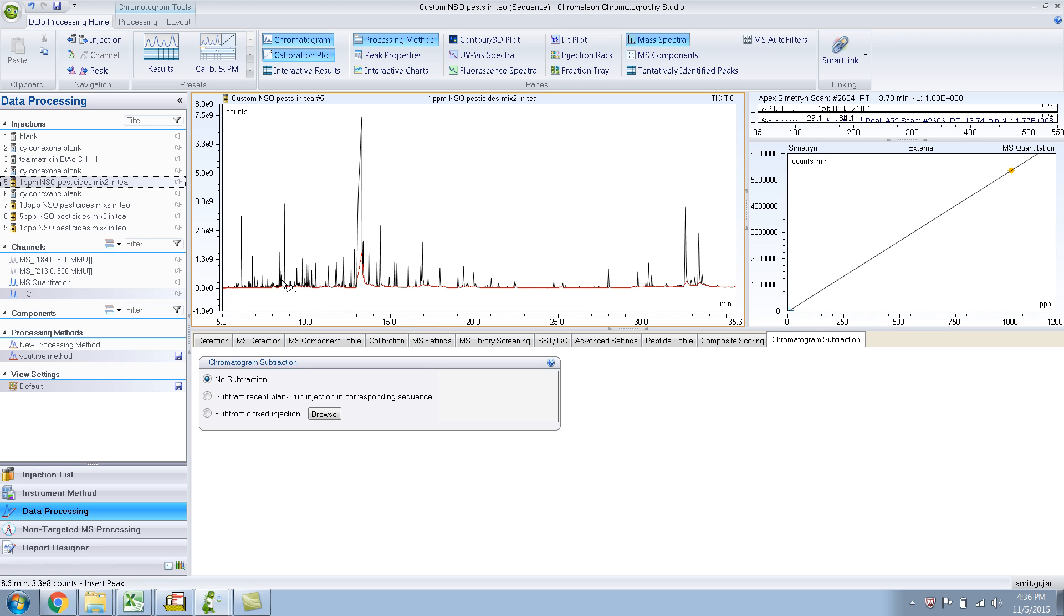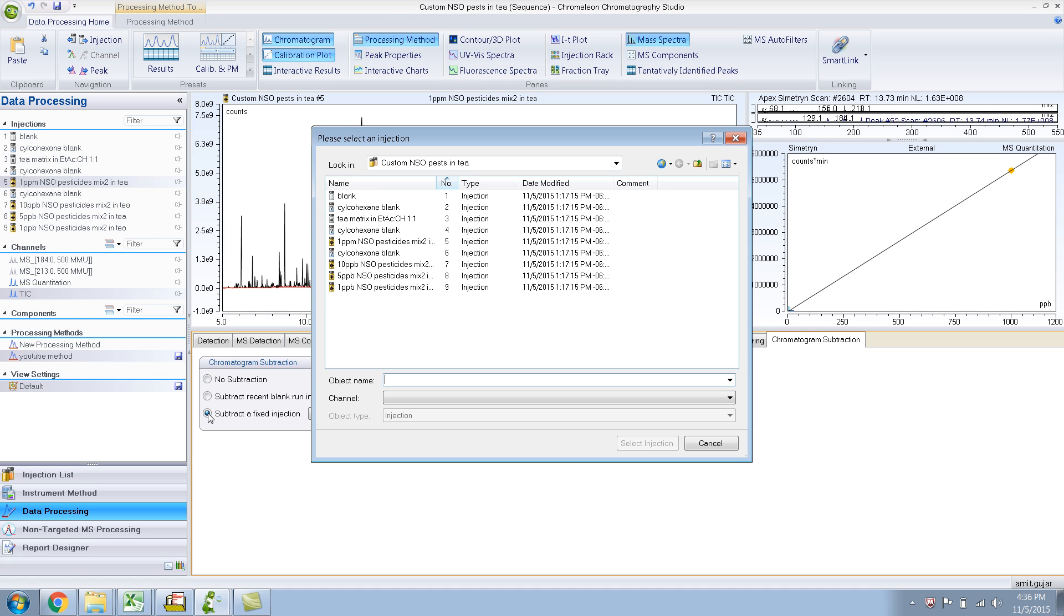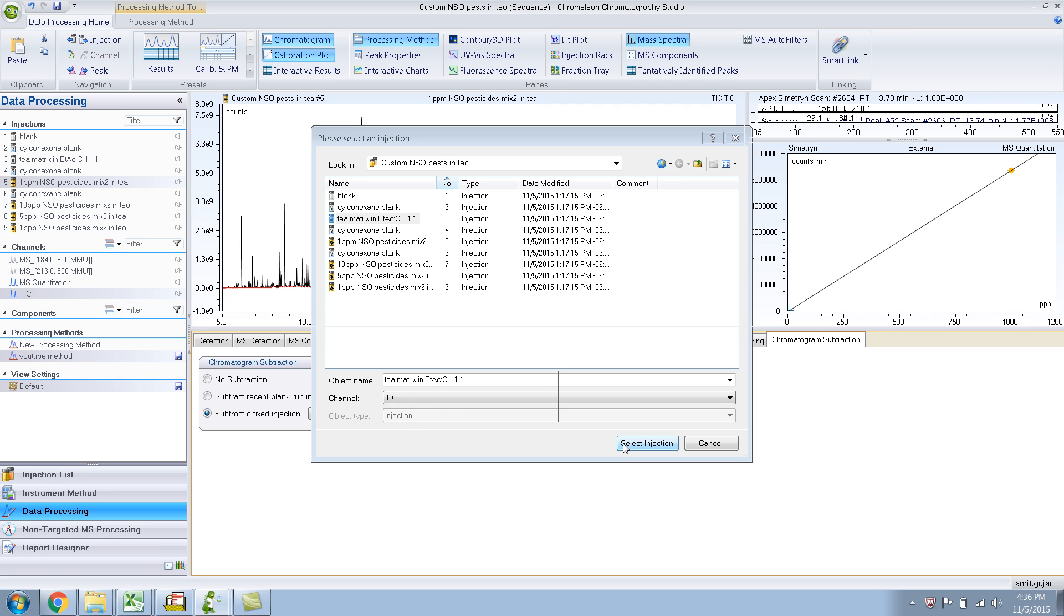What you can do is subtract a fixed injection. Let's say I want to subtract the T matrix. And I select. And it subtracts.